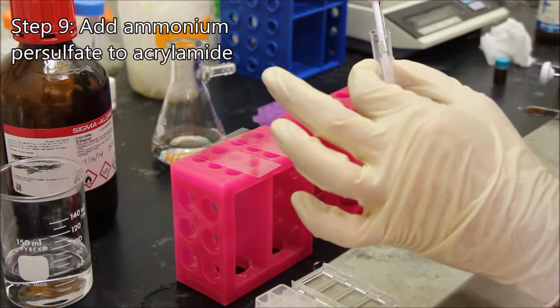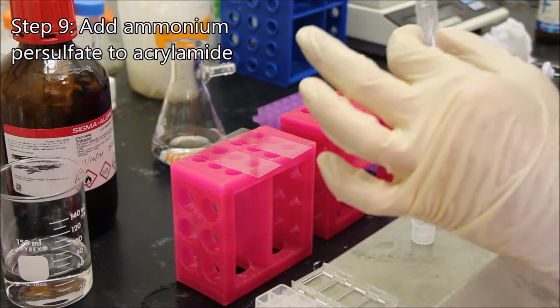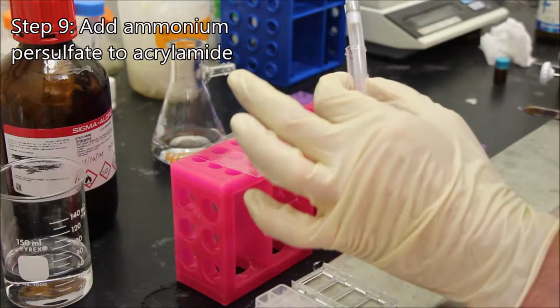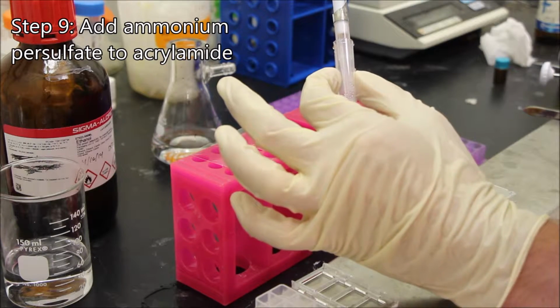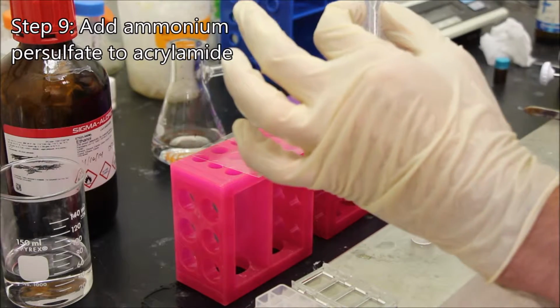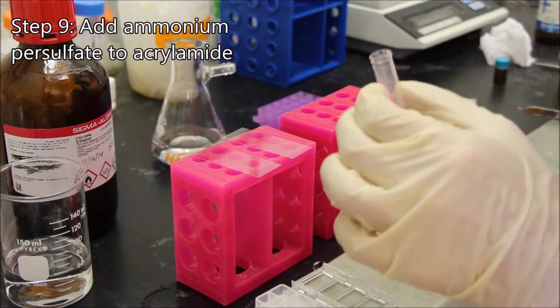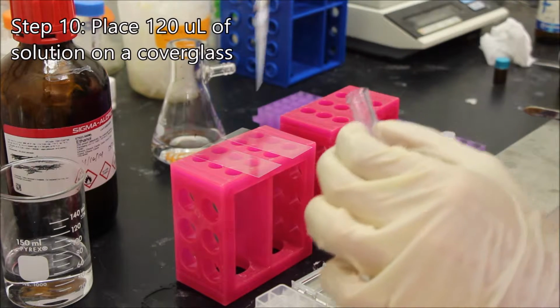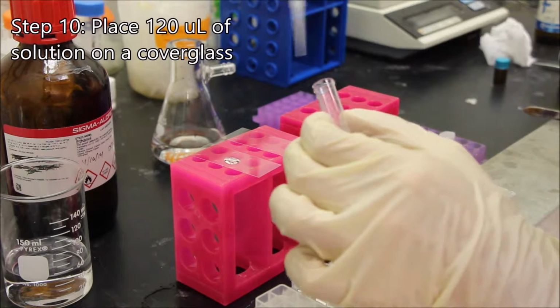I'm gonna add it to the solution, pipette up and down a few times. Going to mix it by pipetting up and down a few hundred microliters, gently. And then I'm going to take 120 microliters per glass slide and put it on the cover slip.